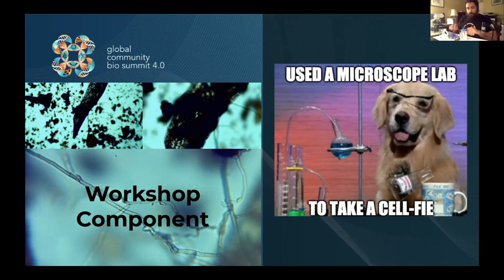Secondly, you're going to want some microscope slides. You're going to want some cover slips. Do you want to unshare your screen? Oh yeah, that's super important.